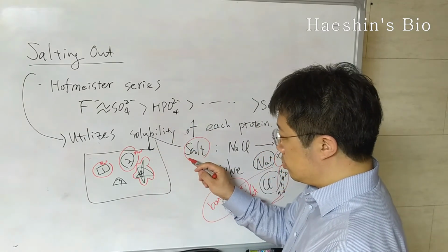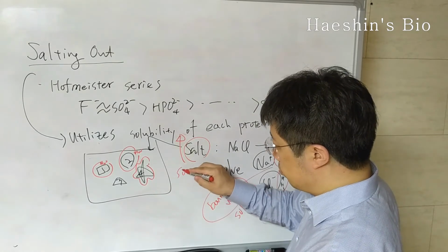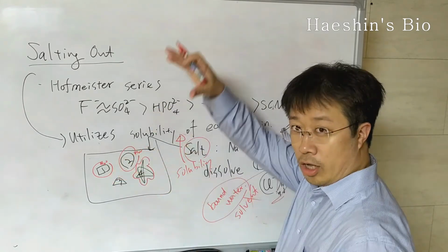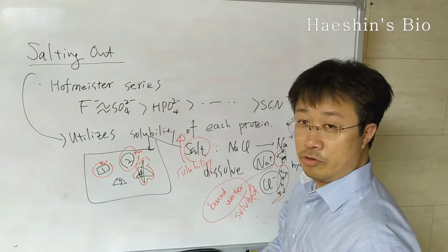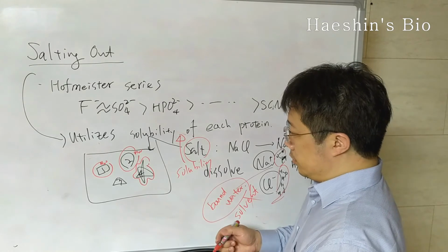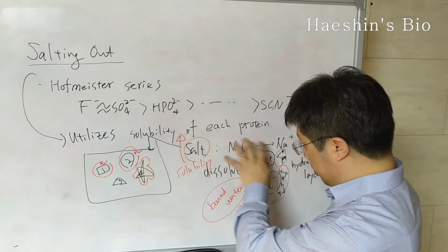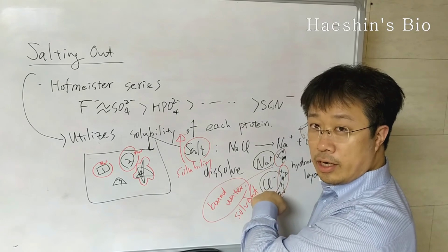But now the solubility of the salt is higher. This is the solubility of the salt. It's higher. This is a huge molecule, but 3 nanometers is like a really huge nanoparticle, like a molecule is protein. Then you add the salt, and then the solubility is higher. Then water actually comes. The remaining solvent water comes to hydrate this ion that we put.